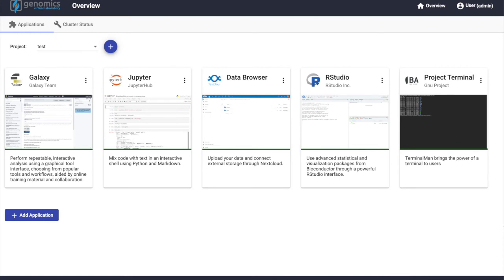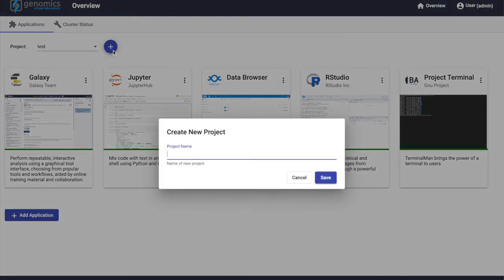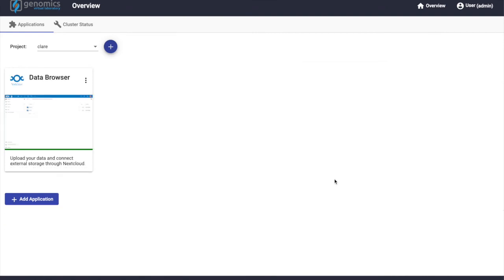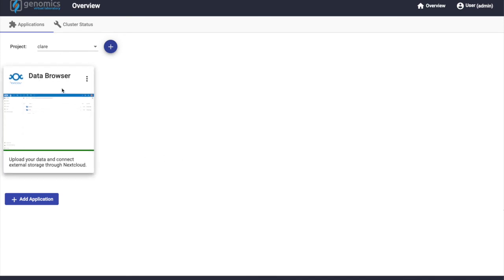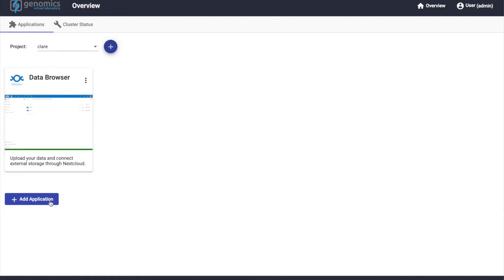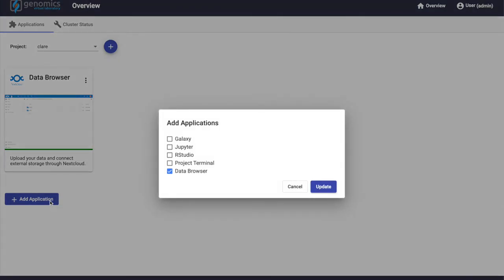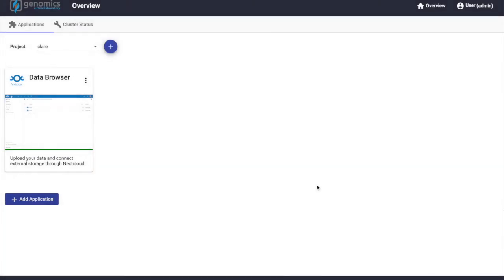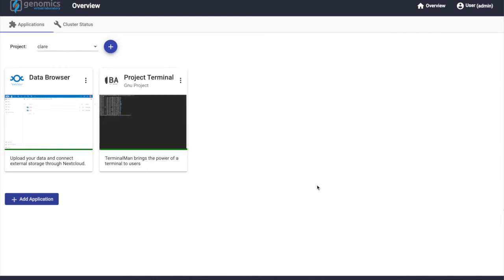In the GVL, there is also the notion of projects. Projects provide isolation between different users and for the applications. We can create as many projects as we would like. For example, if we create a new project, it only takes a few seconds for the project to be provisioned and created, made available. Each project by default gets a data browser that we saw in the previous incarnations. It also has the ability to add additional applications. In this case, let's add a couple of applications that are available that have been integrated with the GVL. At this point, these applications are started in the namespace to this specific project and will be available as soon as the applications start.